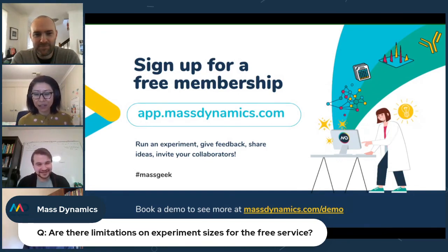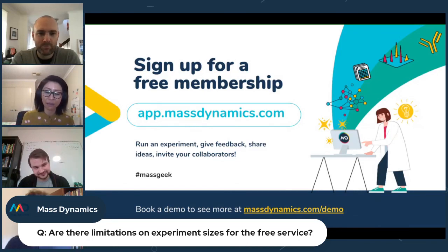I think they're talking about the free service in particular. So no, there are no limitations in terms of what you can upload. You can have as many conditions, as many replicates, as many files and runs as you like. There is no limitation there. And I think what Giuseppe and Joseph are saying is bring it on. Let's see.